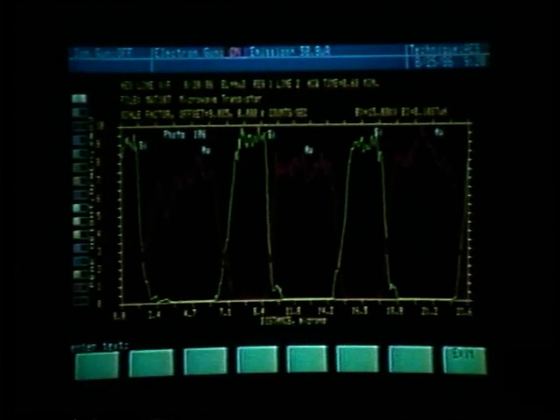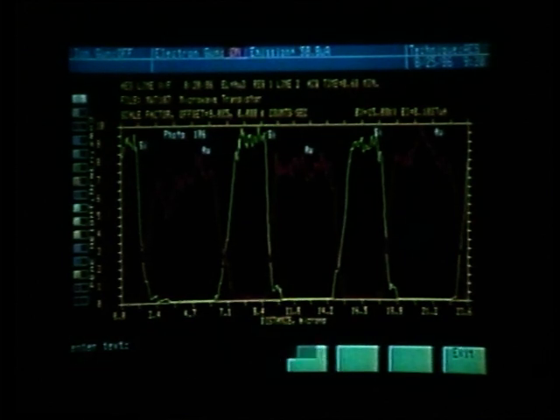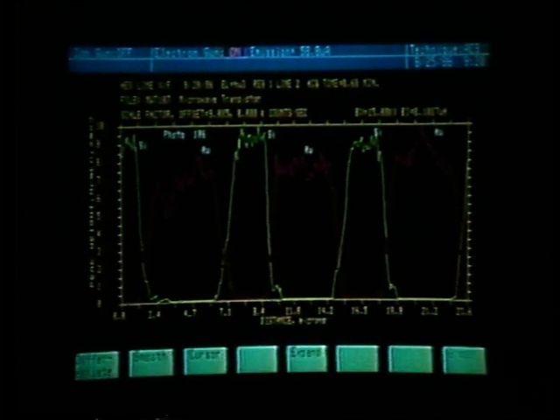Now that we have the proper annotation, we can exit the graph annotate, obtain a copy by holding the control and hitting the print key. Using this same method, we will obtain copies of all 4 line scans and annotate the gold, the silicon, and the tantalum.